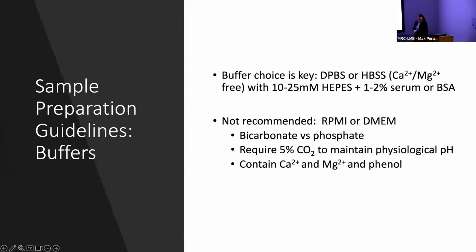And the other thing to think about is to protect the sample from any excessive exposure to light, because some of these sample preparations or media can be light sensitive.